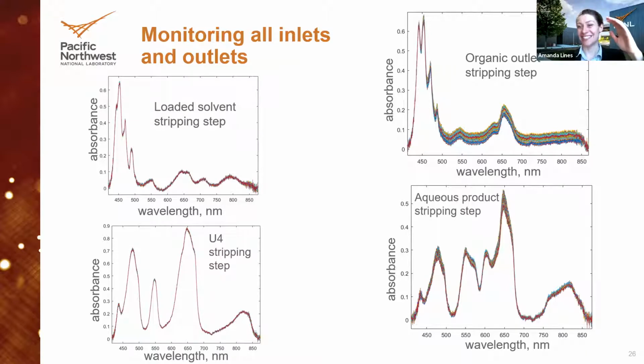Your window darkens essentially, and it can look sometimes like a neutral density filter, sometimes it can have some fingerprint to it, but something like that can just throw a non-robust model for an absolute loop because your baseline has gone totally out of whack. So we take our data sets and we'll normalize or put in appropriate baseline modification steps so that our models can handle even that changing baseline as you irradiate your probe and still output a meaningful quantification of your target.